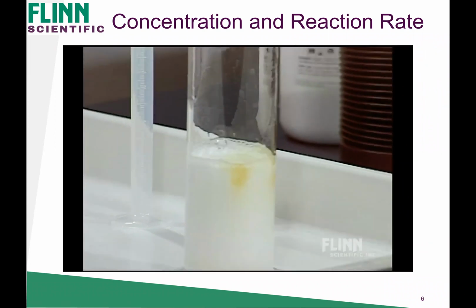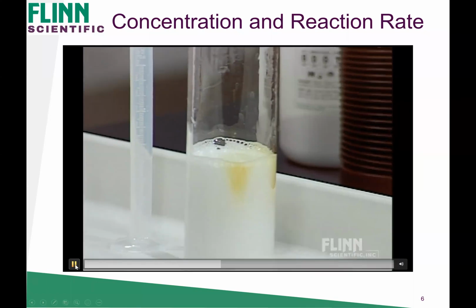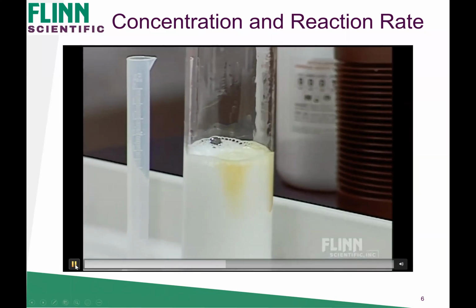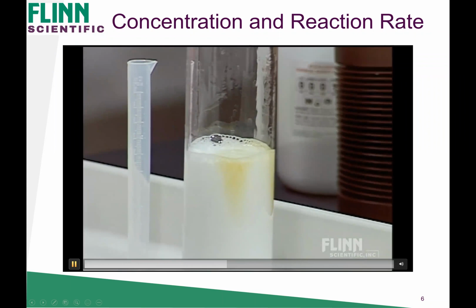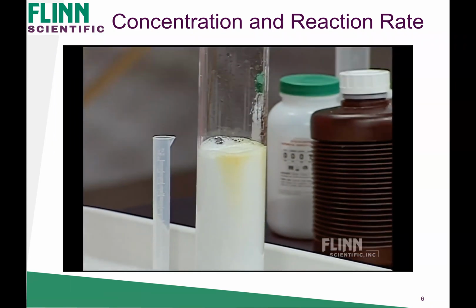So you can see qualitatively here that this is proceeding faster. Okay, so ask yourself, do you think that the concentration of hydrogen peroxide in this flask is lower or higher than the concentration in the previous flask? Now we're going to keep going, and again, you can see this rising steadily, but it's not going crazy fast, it's not overflowing.